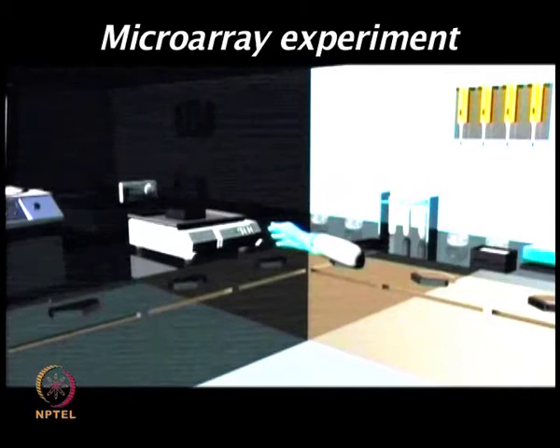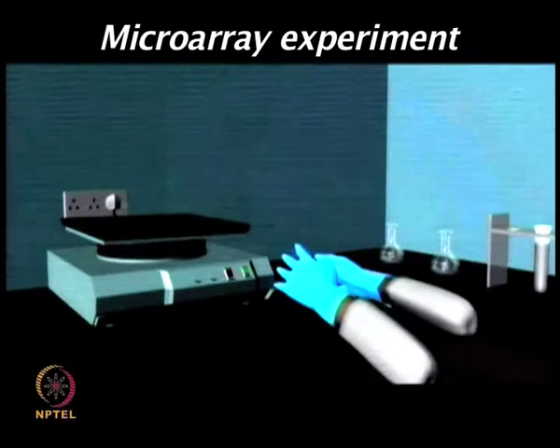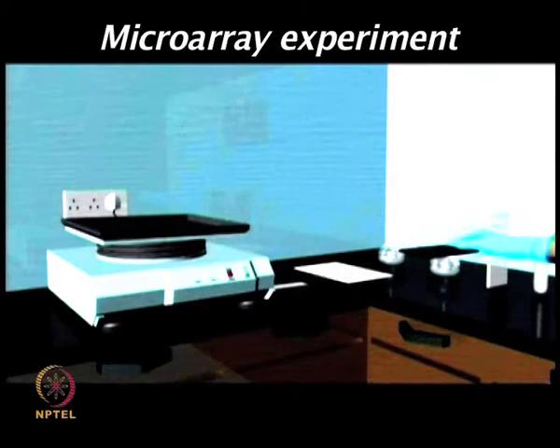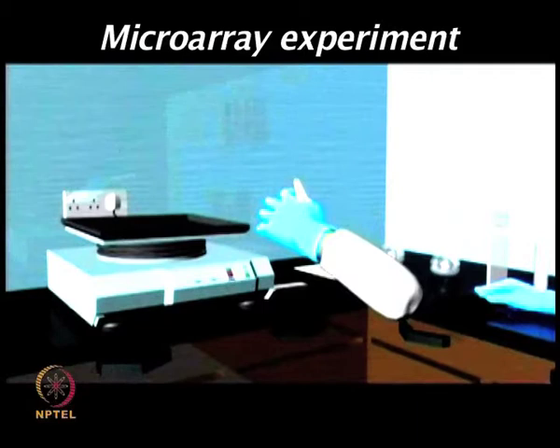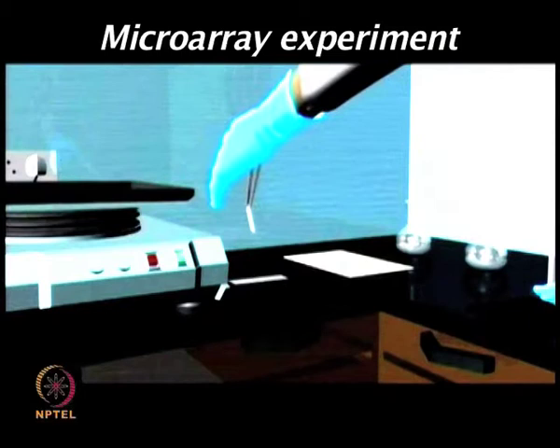Now, when you are adding the secondary antibody, one can also use Cy3 or Cy5 conjugated antibodies, and those could be directly detected. After the secondary antibody, one needs to wash the arrays again with PBS three times, similar to what we performed in the last step.